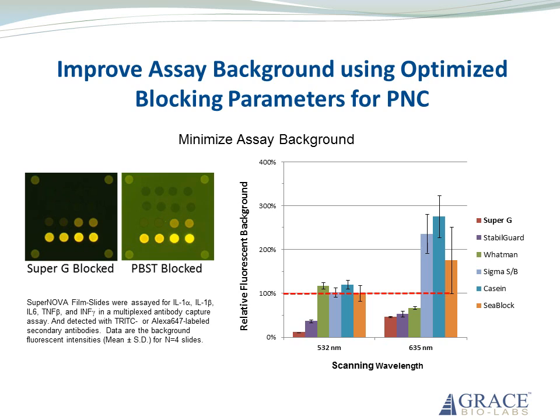You get higher backgrounds and inverted spots where the spotting material actually blocked better than the blocker itself. As you can see here, effective blocking can prevent this and give much lower background. In fact, many common blockers do not effectively block PNC. Take the milk protein casein, which is an effective blocker for Western blots. It actually results in increased backgrounds, along with various other protein-based blockers.